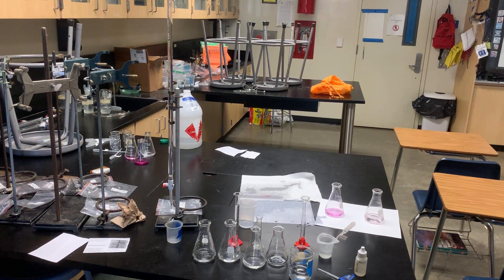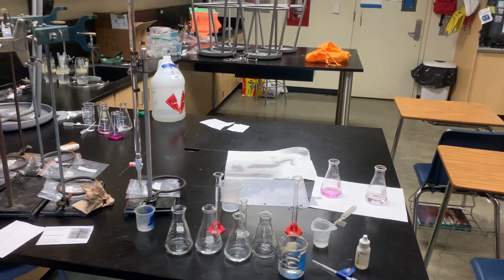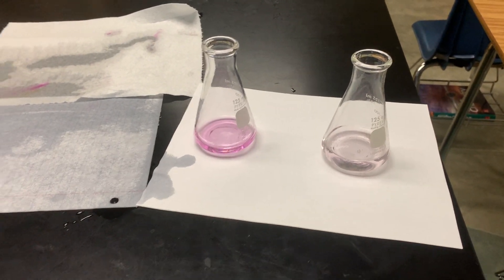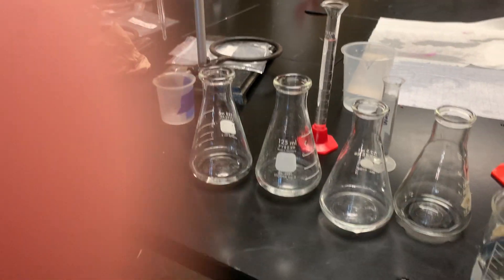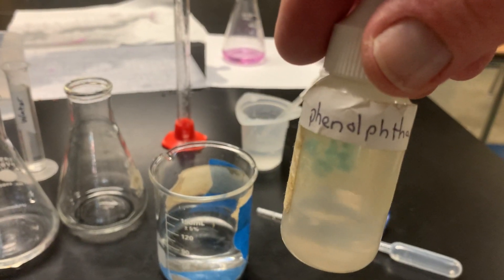This is a quick titration demonstration. The objective is to reach a light pink color. I have three flasks ready to go, each containing exactly 10 milliliters of acid and 10 milliliters of water, and I've added two drops of phenolphthalein to each.